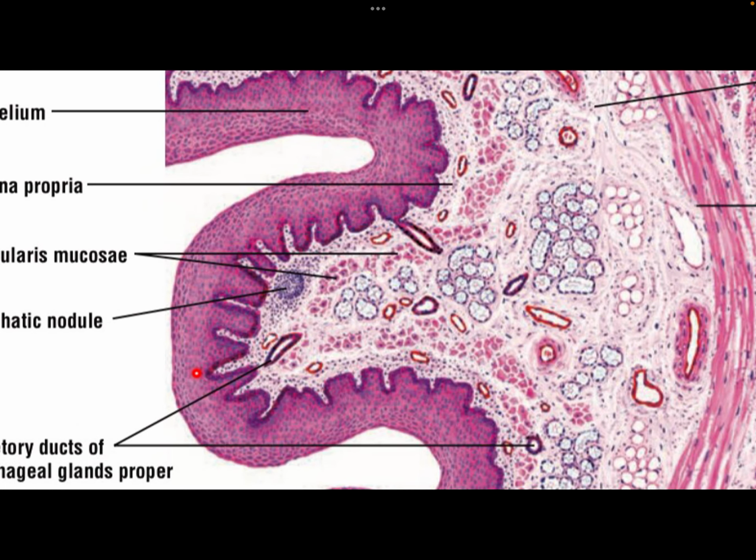If you look at this, you see a lot of nuclei, and that is stratified because the esophagus is receiving food, and that food has different textures, and I really need to protect my epithelium from any damage. So the reason why I have a stratified squamous epithelium in the esophagus is protection.